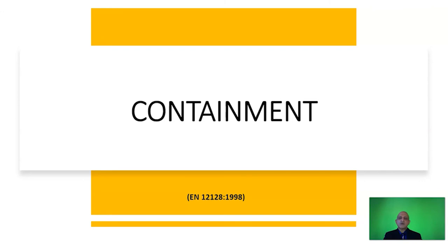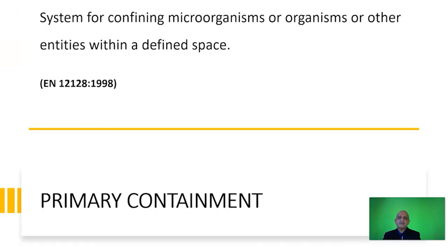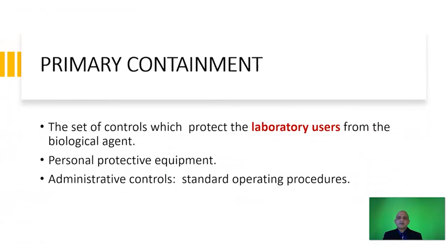We now move on to another very important term, which is the word containment. Containment is a system for confining microorganisms, organisms, or other entities within a defined space. And this defined space may relate to your containment facility or biosafety level 3 or 2 laboratory. Containment is divided further into primary and secondary containment.